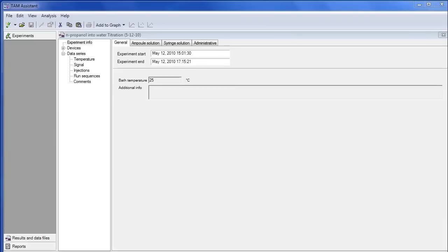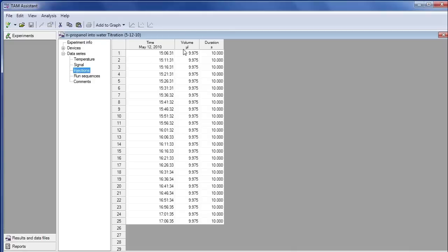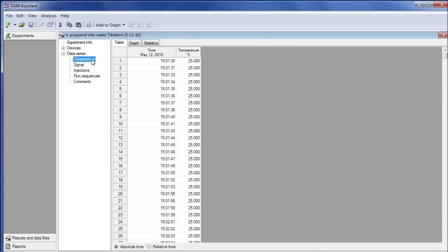The first step when importing TAM ITC data into NanoAnalyze is to open the data file using TAM Assistant and inspect the file within that program. Items to inspect are the injection volume and the duration between each injection. It's also important to know the temperature at which the experiment was being conducted.